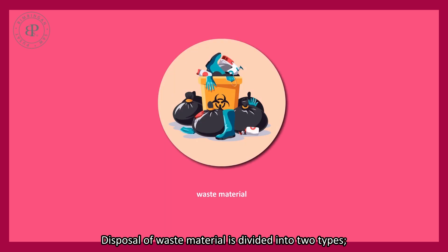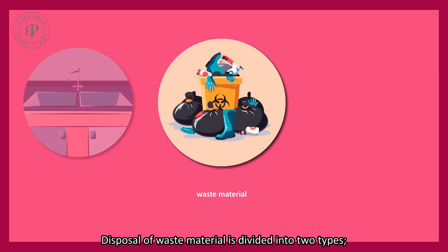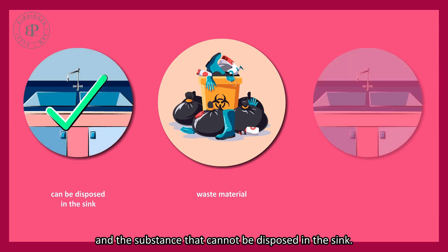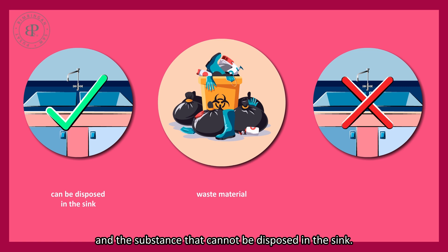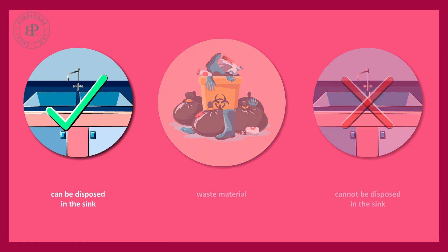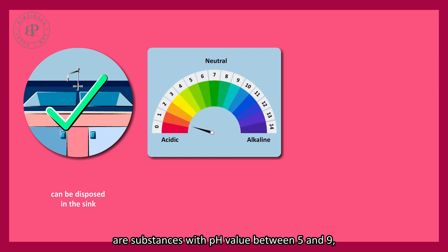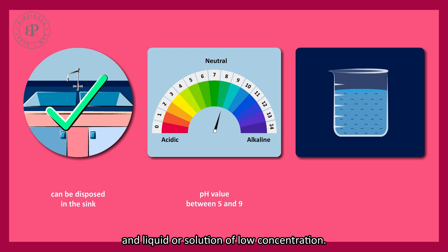Disposal of waste material is divided into two types: the substance that can be disposed in the sink and the substance that cannot be disposed in the sink. Substances that can be disposed in the sink are substances with pH value between 5 and 9, and liquid or solution of low concentration.